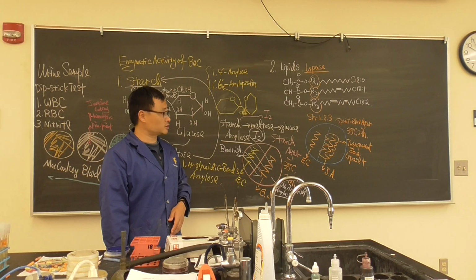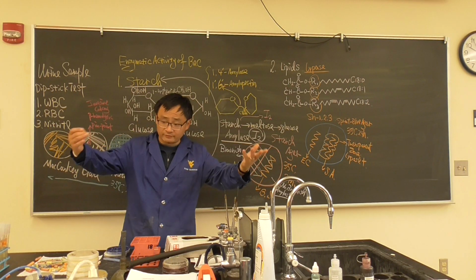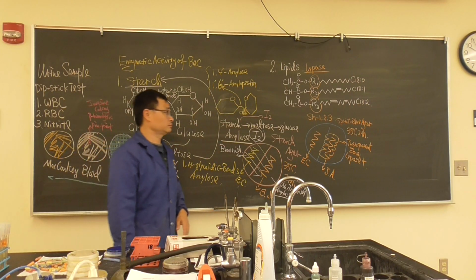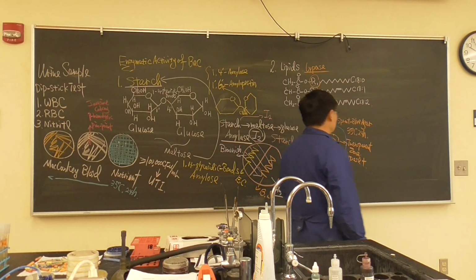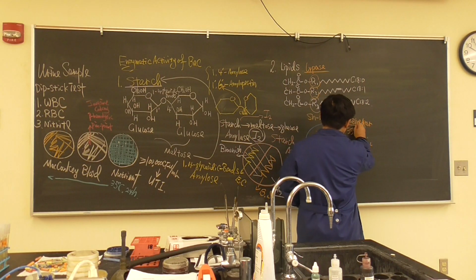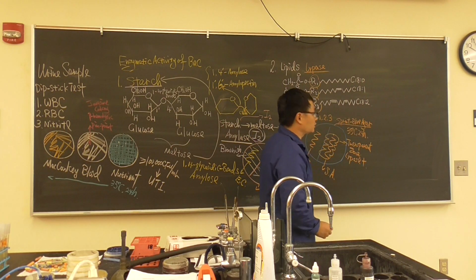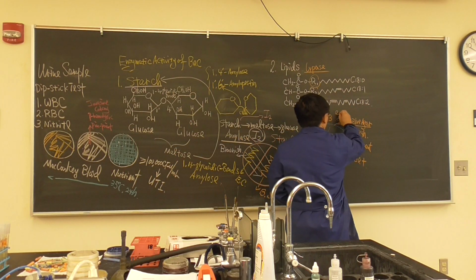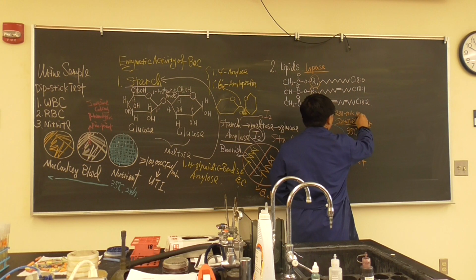Okay, it's a very smart way for bacteria to use it. So think about in the environment, if you don't have glucose, you don't have starch, I only have lipids, so you have to use it. And they will grow very well. Now we're using spirit blue agar. There is another agar we also used before, egg yolk agar could be used.